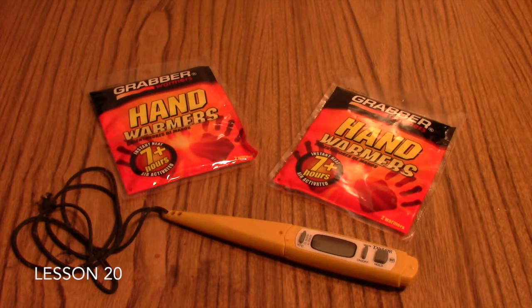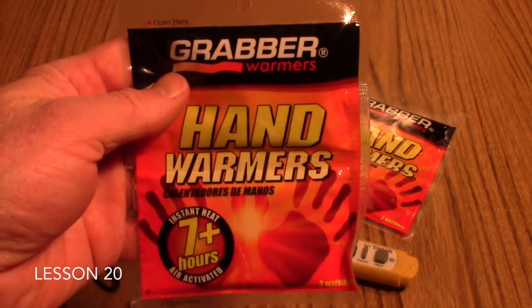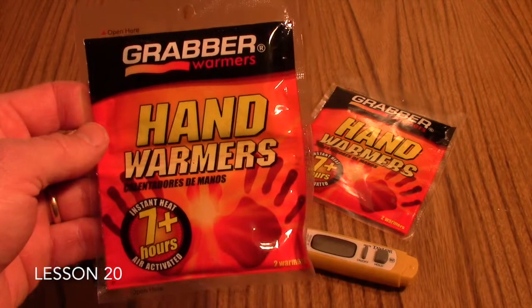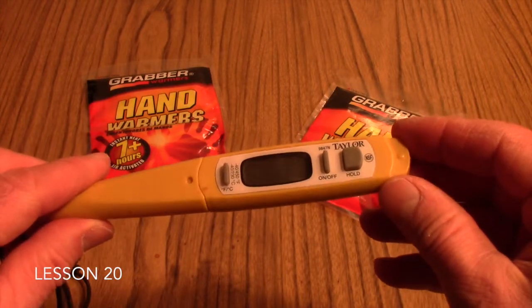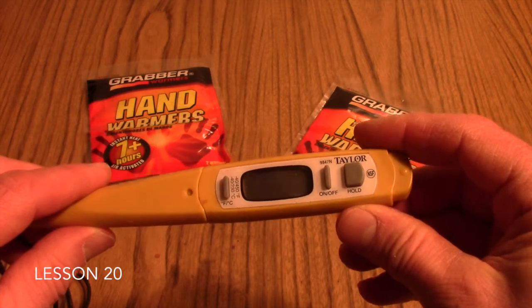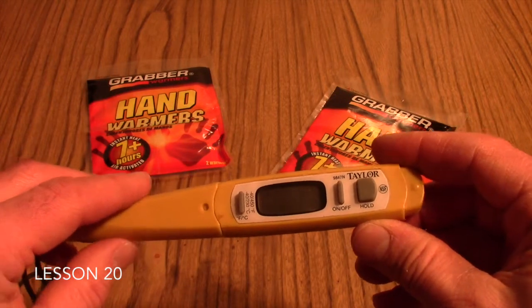reactions or exothermic reactions. For a demonstration here, we have some instant hot pack or hand warmer products. In addition to the hand warmer packs or cold packs, you'll also need access to a thermometer. A digital thermometer is ideal for this laboratory, and it doesn't really matter if it measures in Fahrenheit or Celsius degrees, but digital is ideal.